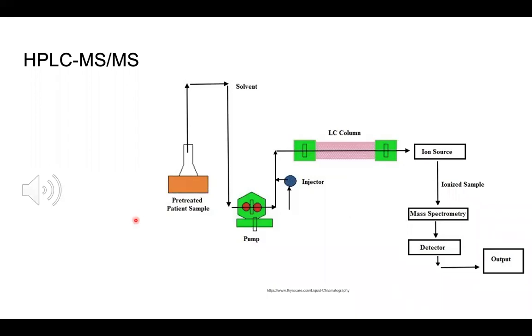Some works have actually pointed out that one-dimensional gas chromatography doesn't offer enough resolution to separate such complex mixtures as these. And then some studies have actually successfully used two-dimensional gas chromatography to establish chemical profiles of cannabis.